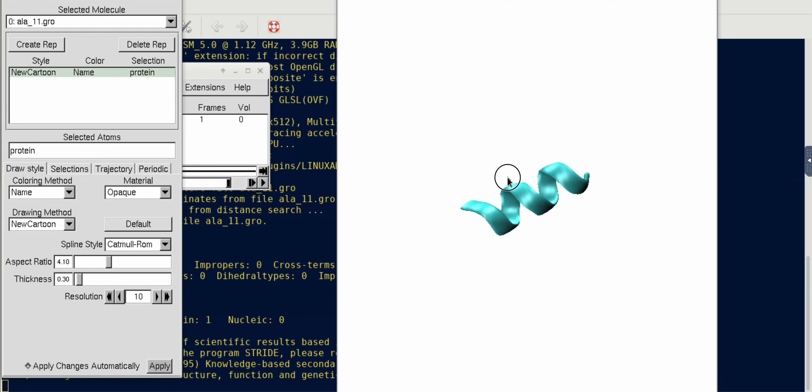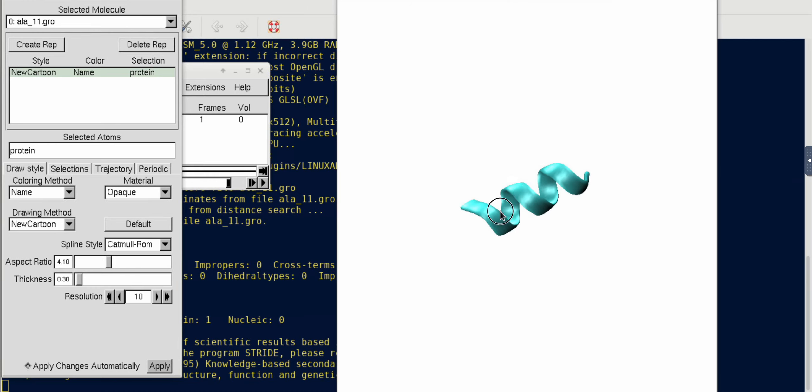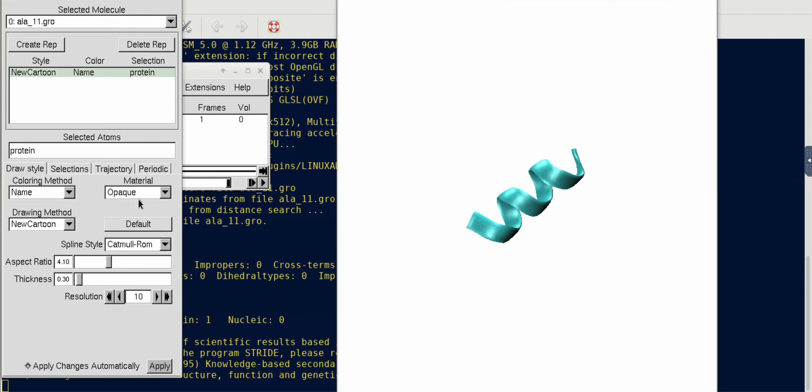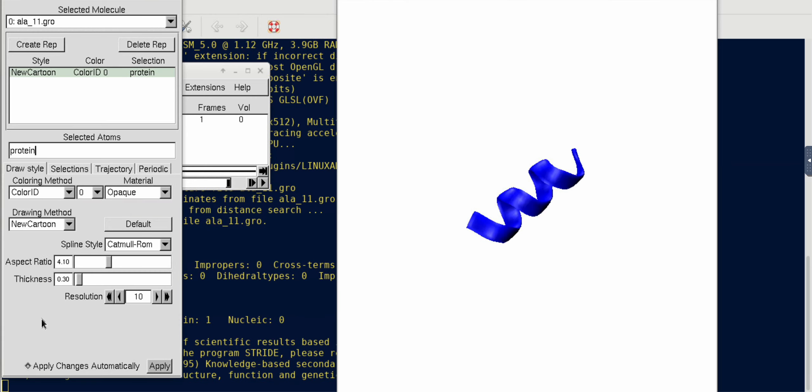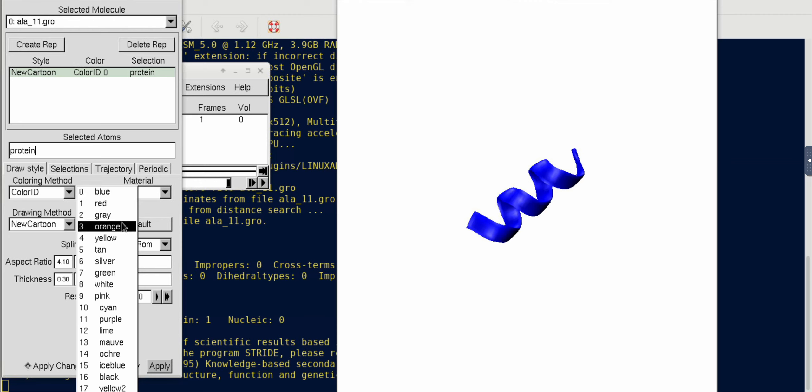We have to go to Graphics and then go to Representations. Here in one rep I'm going to write 'protein' which will only highlight the protein.